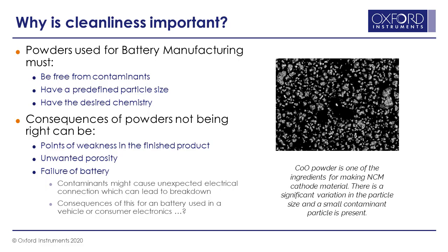The extreme case leads to failure of the battery itself. An electrically conductive particle that comes in and causes a short circuit at an insulation barrier can lead to problems such as thermal runaway. Shown here is an electron image of one of the powder materials typically used in lithium-ion batteries — in this case a cobalt oxide, one of the precursor materials for the cathode. You can see quite a large variation in particle size, and you can also see that there are actually some contaminants in the powder. So it's very important to control not just contaminants but also particle size before starting to process the material.